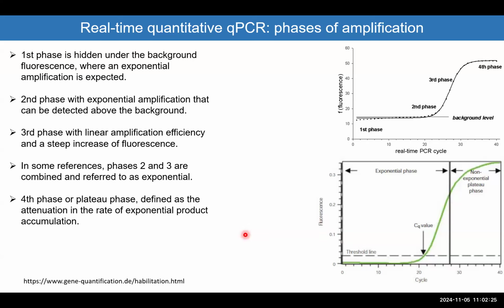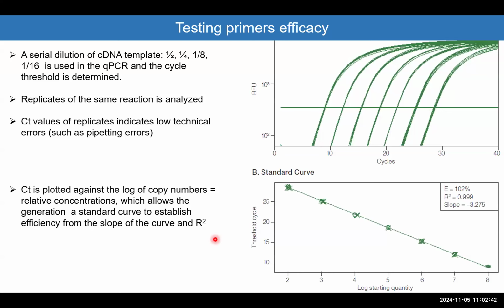So far, there is nothing really crazy about what we added in terms of the qPCR compared to the general or regular PCR. It's simply just the fluorescence that we are detecting here and some specificity of how you design the primer. Now, the first thing you have to do is to check if your primer is specific.